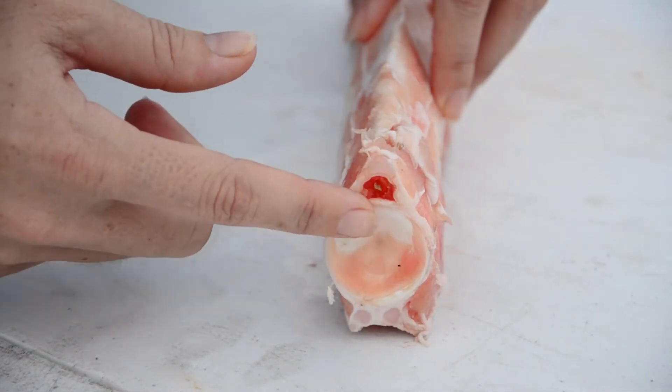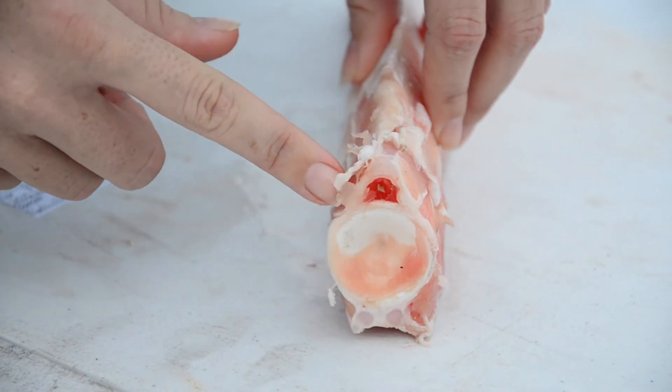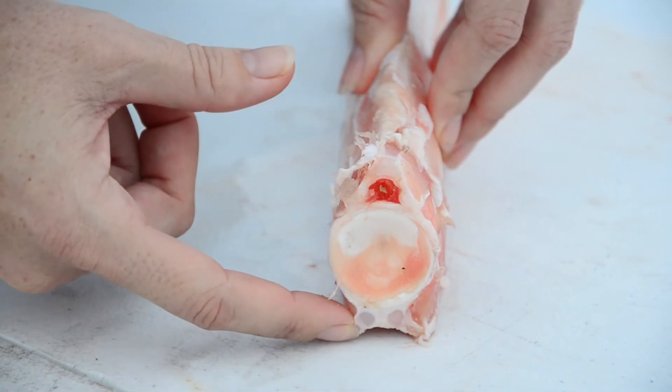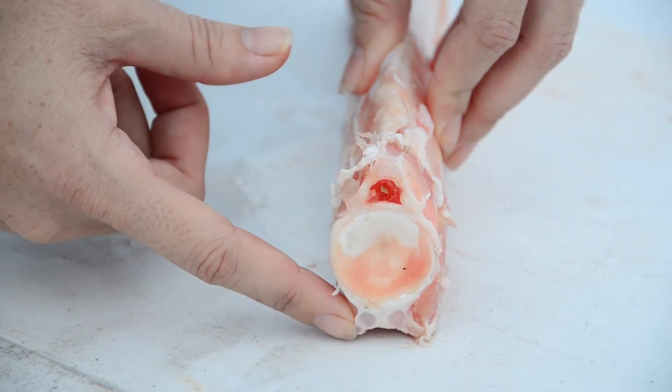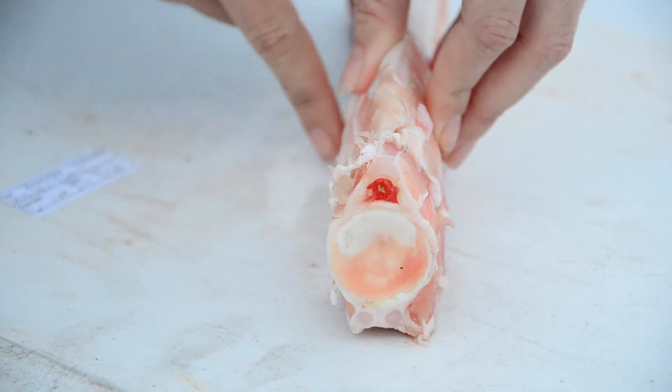Looking at the side section of the vertebrae, here we have the neural arch and then we have the supporting processes. We actually don't need any of this material for our age and growth studies, so what we're going to do next is give it a clean and remove these external parts.